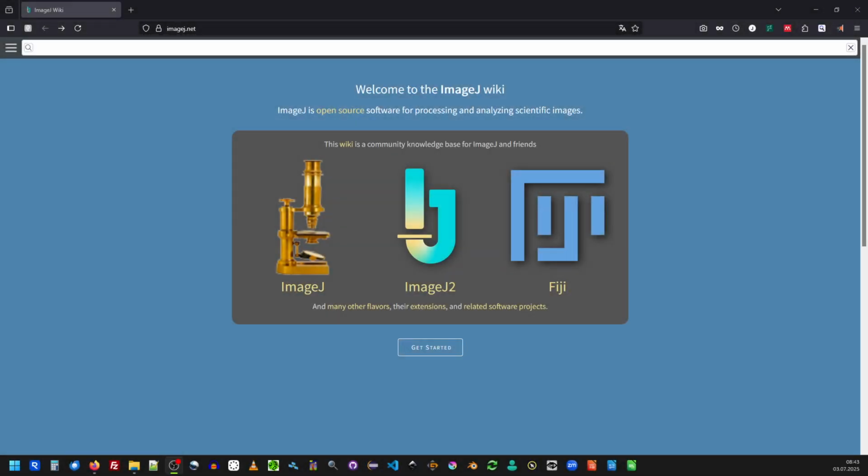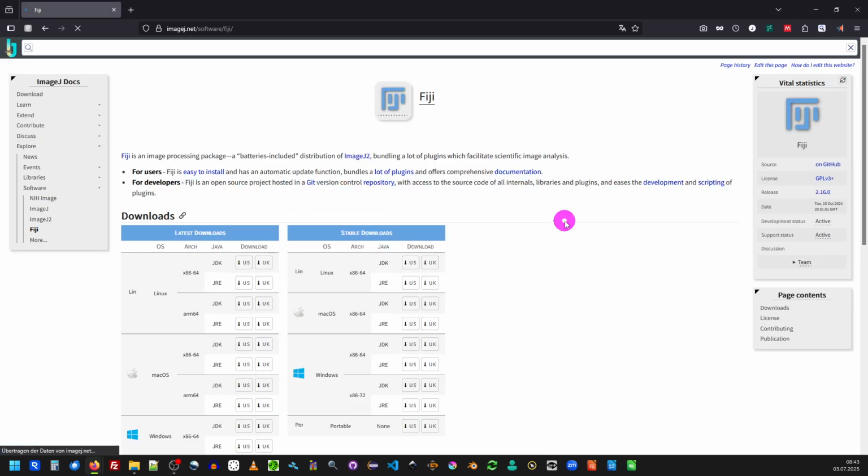Welcome to this installation video for Fiji on Windows. You were provided with a link that leads you to the Fiji download page. This is available here under this icon.